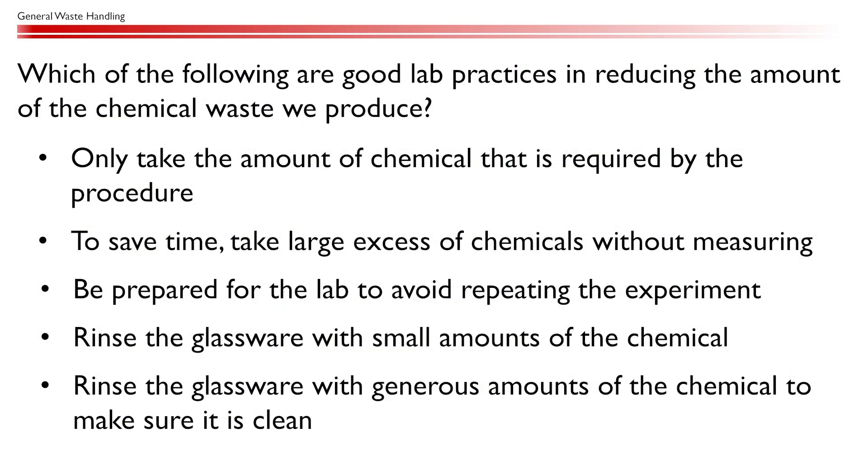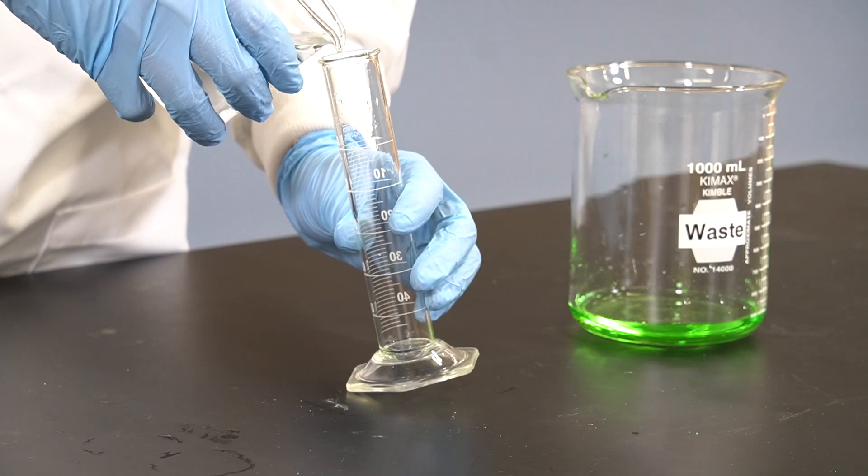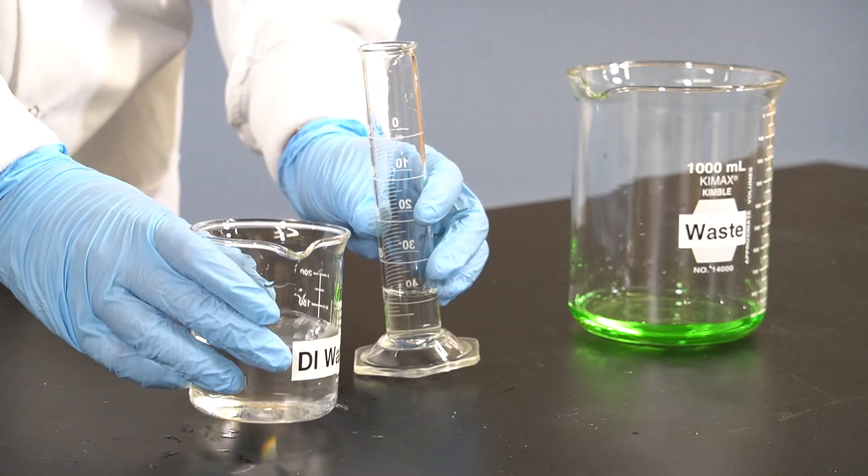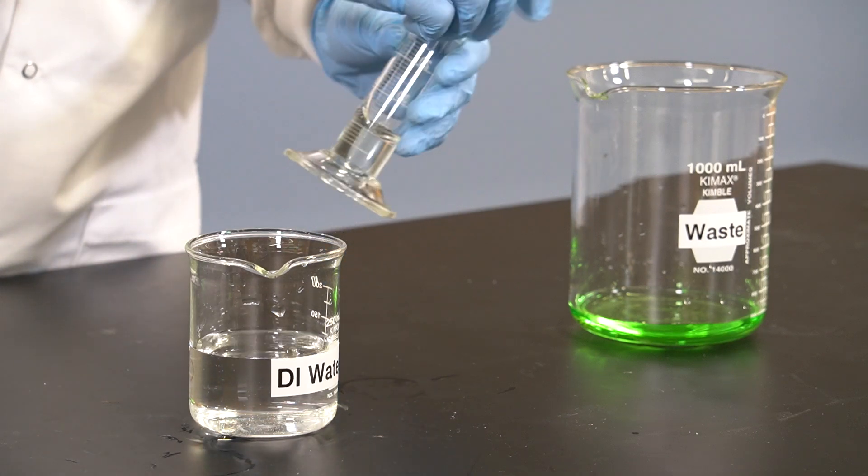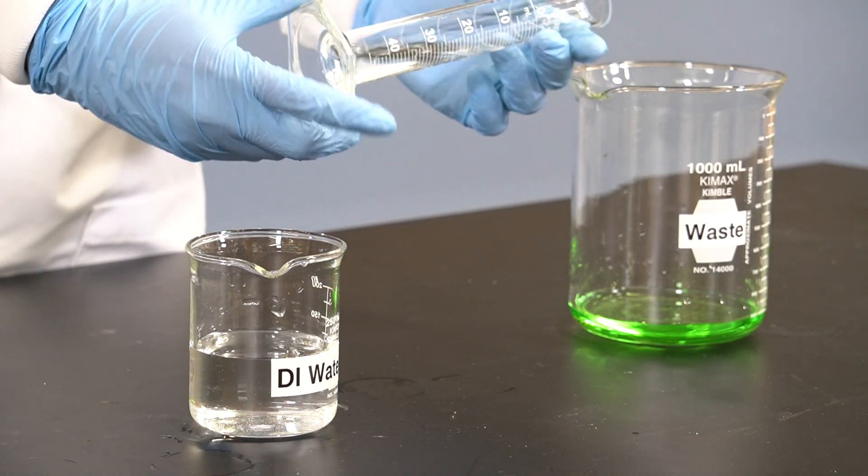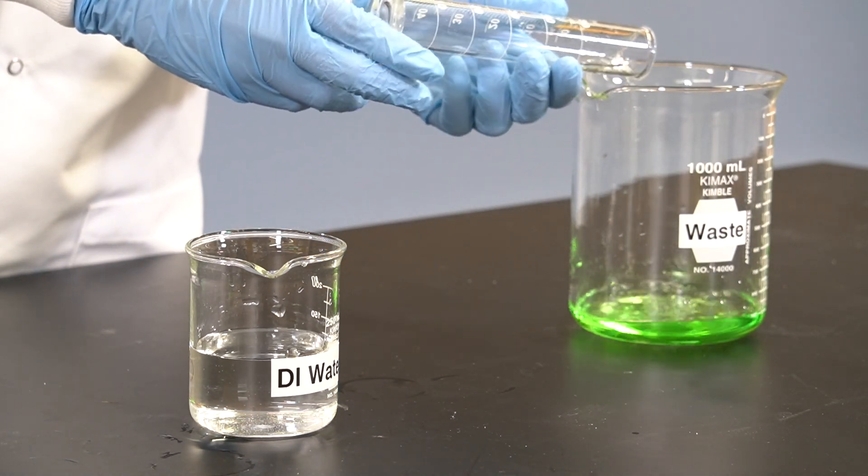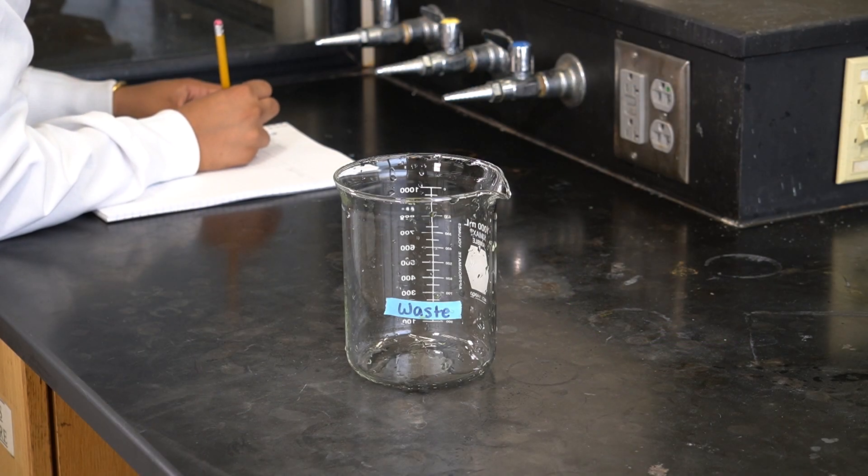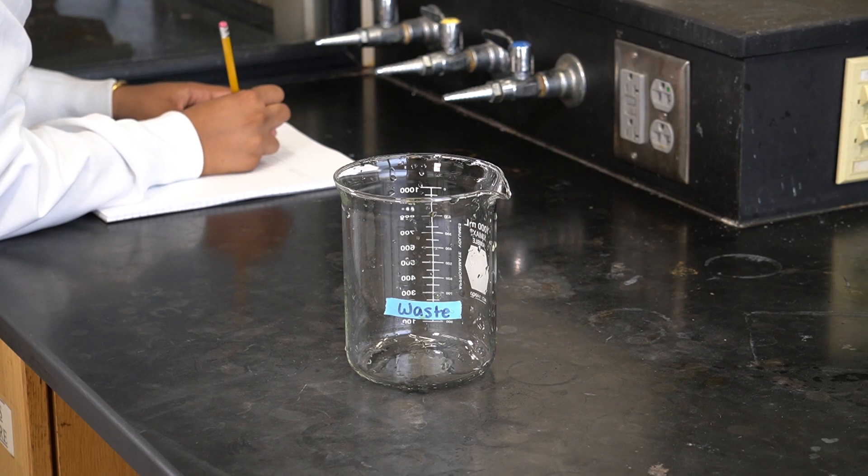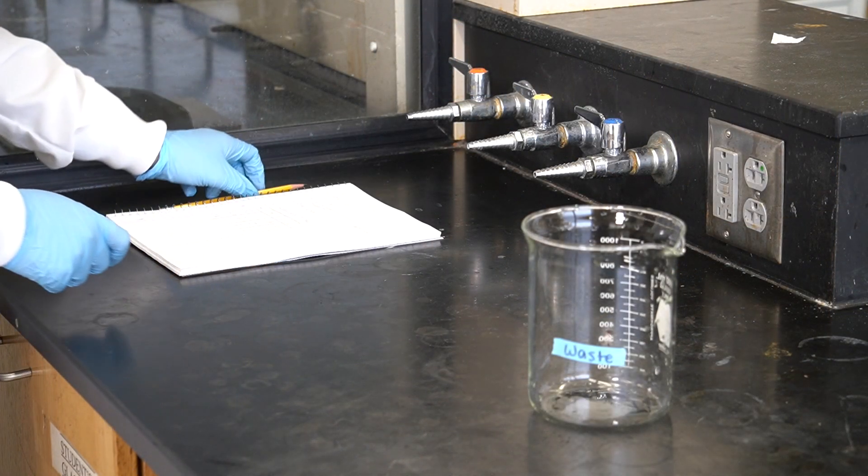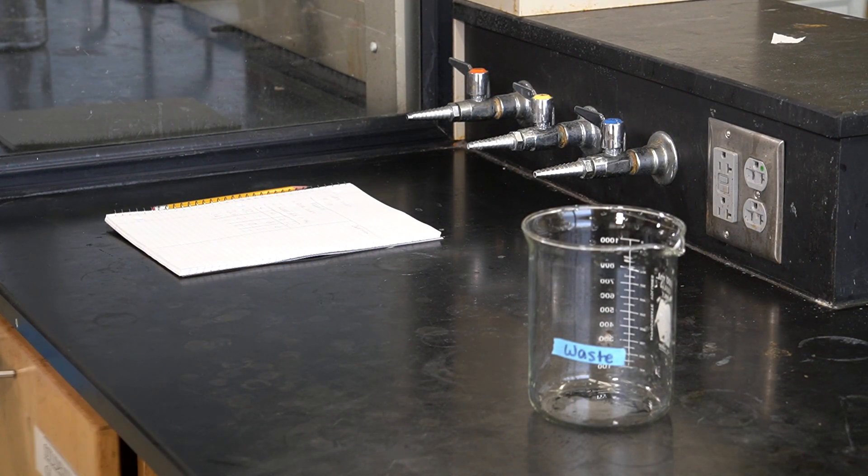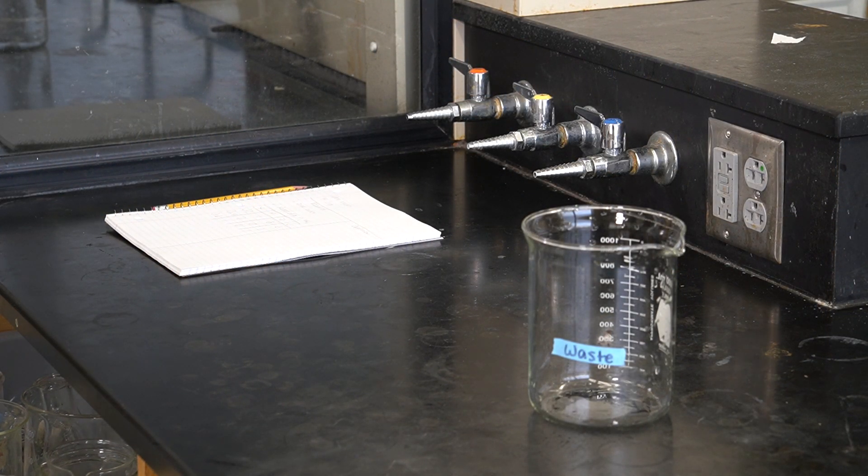Which of the following are good lab practices in reducing the amount of chemical waste we produce? Never take more reagents than what you think you'll need, and always rinse with limited amounts of chemicals. These two practices are essential for minimizing the amount of waste you generate. And of course, being prepared for the lab substantially reduces the chances that you will need to start over. If you do need to repeat an experiment, then you would be making much more waste than is necessary.